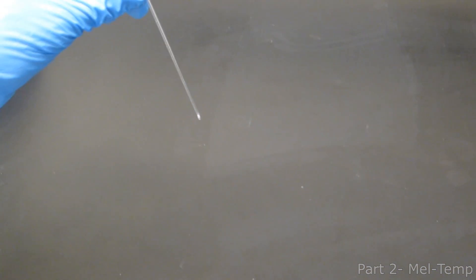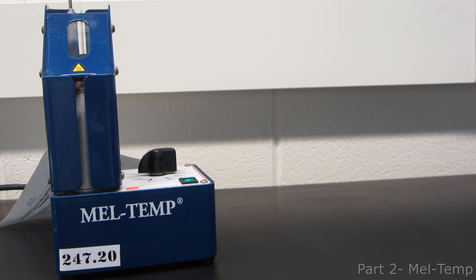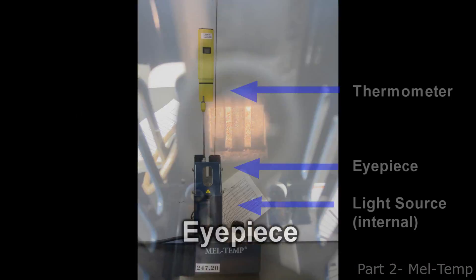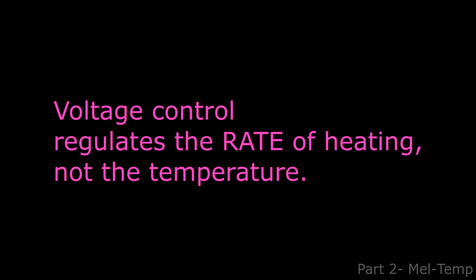With this technique, melting points are obtained in thin, closed capillary tubes. This is the Meltem apparatus we will be using. It has a thermometer, an eyepiece, a light source, a voltage control, and an on-off switch. Again, the voltage control regulates the rate of heating, not the temperature.